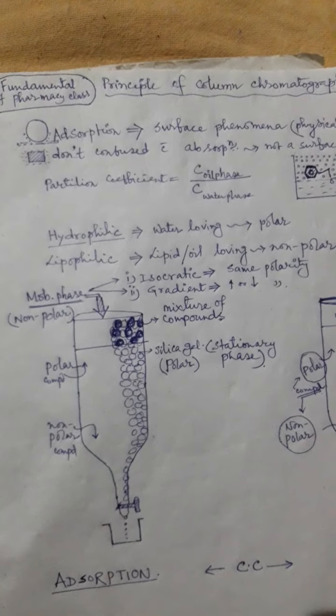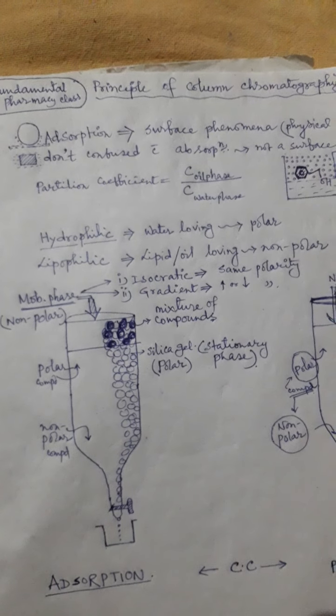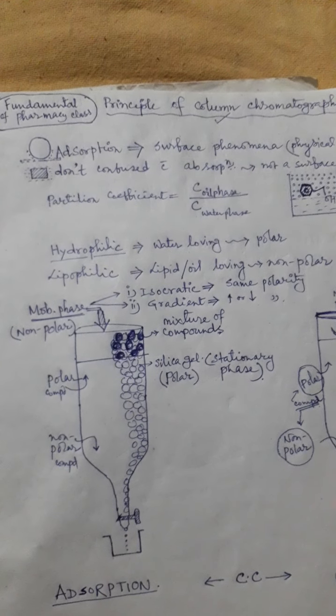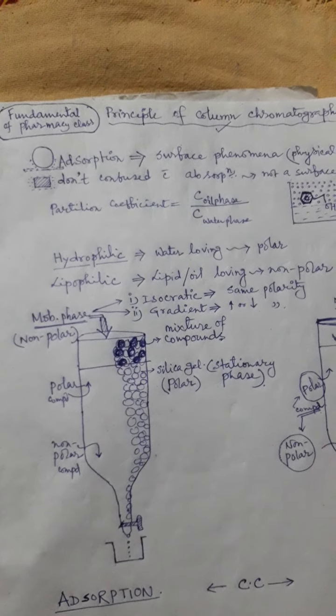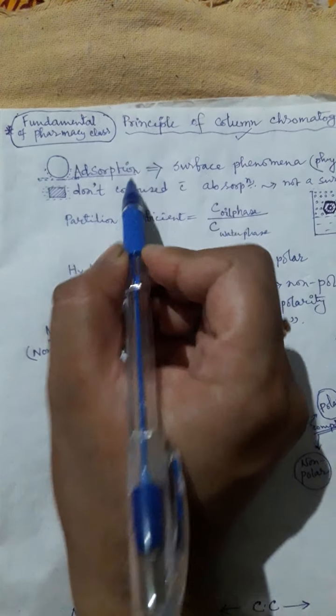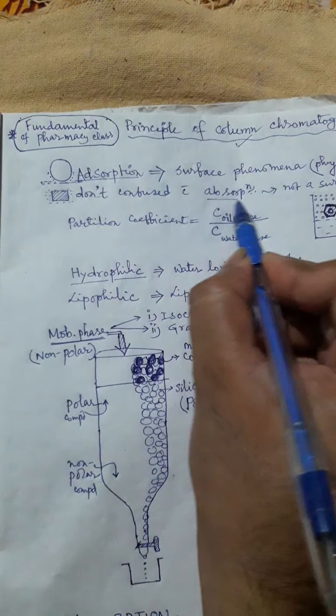Today in this video I would like to discuss the principle of column chromatography. So before discussing that, I would like to discuss two things. One is adsorption, another one is absorption.